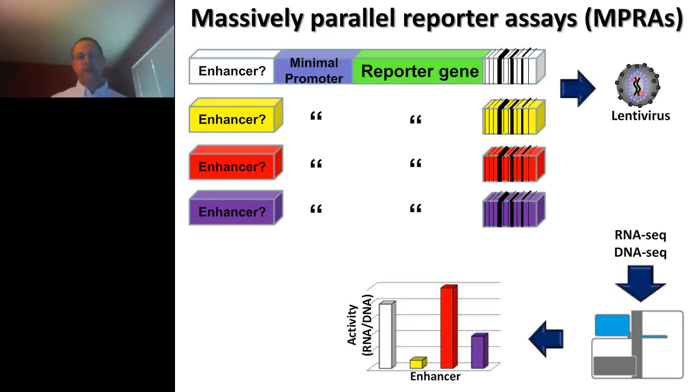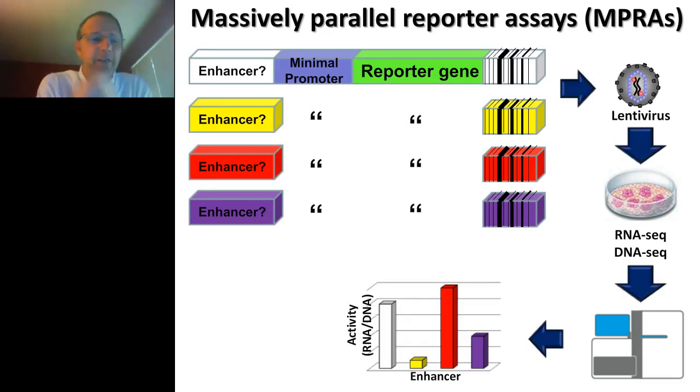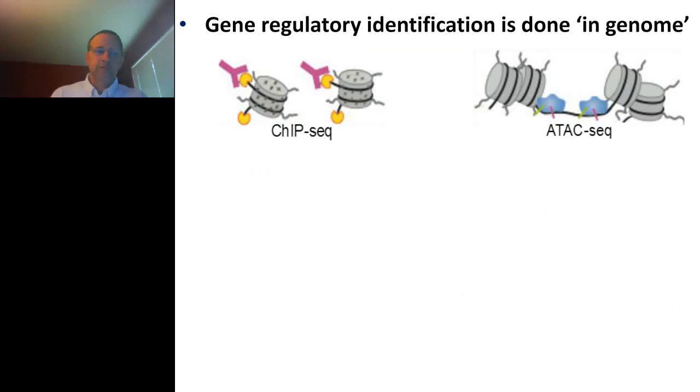And the second is that it not only infects the cells, but it integrates into the genome. And so we can measure the enhancer activity of something that's integrated within the genome versus everything that I've shown you until now, that is non-integrated, that is episomal, that doesn't actually go into the genome. And so it might not be affected by the chromatin marks or other things that could be involved when things integrate into the genome. And so with lentivirus, our first study was to ask the question, is there actually a difference between things that integrate versus things that don't?